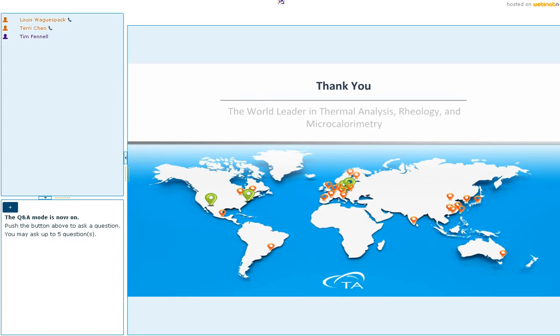Here's one on multi-wave. Is multi-wave functionality available on any rheometer? Wonderful. This multi-wave function is available on both TA Instruments Discovery Hybrid rheometers and also the ARES-G2 rheometers. I have an applications note paper on this, and also one of my colleagues planned to submit a paper to ANTEC. We were about to present this topic at ANTEC, but unfortunately it was canceled due to the coronavirus pandemic. But we do have an applications note. If you go to the TA Instruments website, you should be able to find an applications paper on multi-wave functions, specifically discussed on both models of TA Instruments rheometers. If you don't find it, simply give us your email address, and I'll be more than happy to send you a copy.